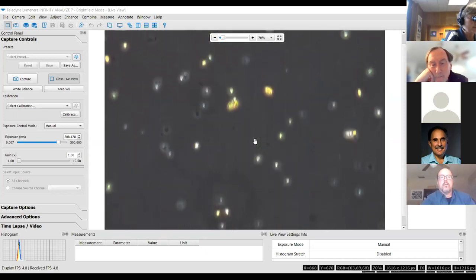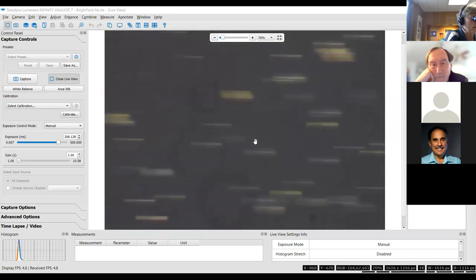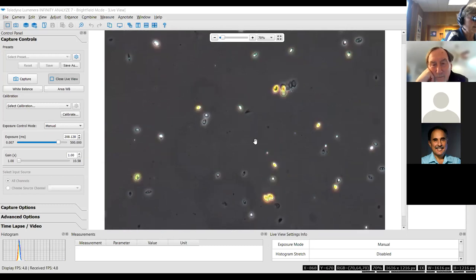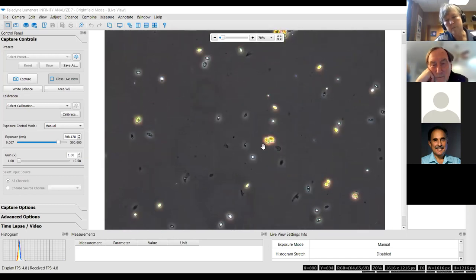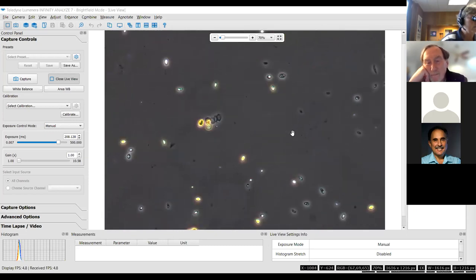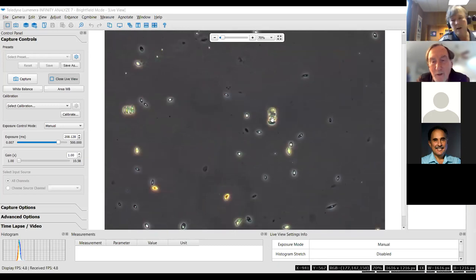With this particular sample, it was actually hard initially for me to come up with a field that would not have the stuff in it that would give it away. And of course, now that I'm looking, most of the fields are doing things. There we go. This is a sample of really high nitrogen, and it's Scenedesmus for the most part, and it's rapidly reproducing. There are actually two or three species in here, but here's a colony where only one of the cells is still living, and that one is divided in that way, and here's one that comes off that way. Most of these are Scenedesmus and Acutodesmus cells. So there's a full colony, and here's a full colony.